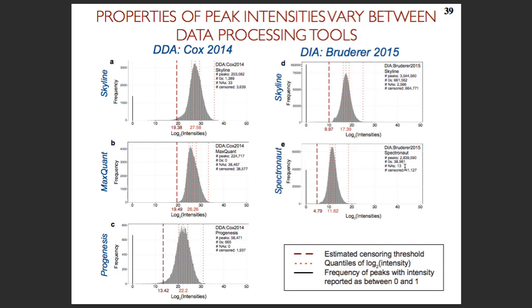And so essentially what it means, and we have been working with this for a while before we realized that we should not take these values literally. Because essentially what happens is that different developers and different tools make use of different devices to report problems with data quantification. So essentially when the peak is standalone, well-resolved, and nice, the values will be very similar. The main difference happens when the peaks overlap, or, like in SRM, if they're outside of the scheduled window, right? Or if the peaks are close to the limit of detection or limit of quantification. This is where different tools really differ. And they make different decisions because they were developed in different contexts for different instruments, potentially, with different purposes. So it's not a problem, but for us, we need to read between the lines and try to interpret exactly the intention for these tools.